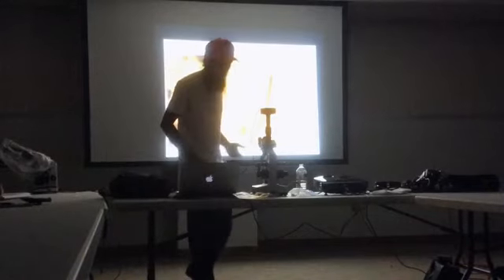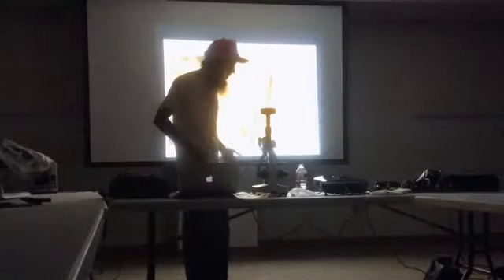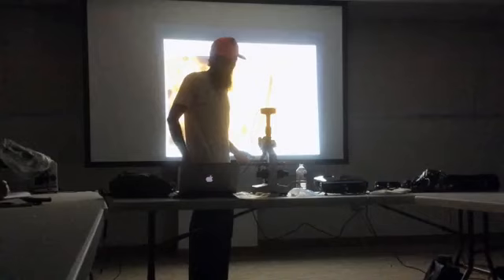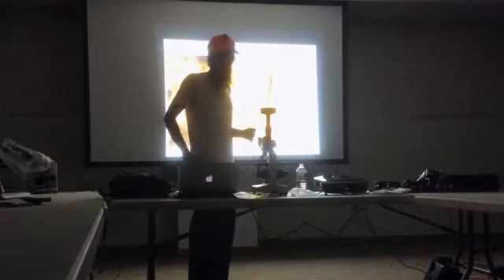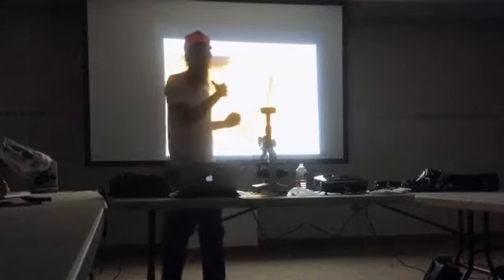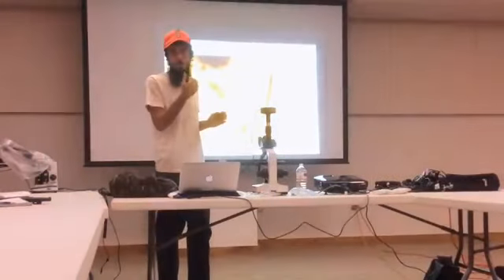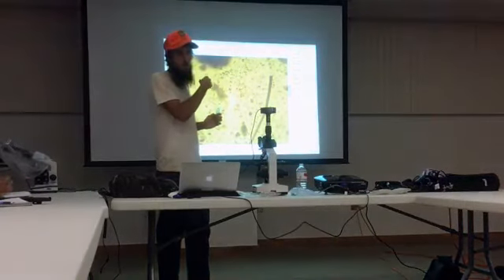Cool, so that was that sample. I've got to clean up some equipment till I do the next sample. But how do you want to do it? Do you want to all continue to look at these samples and go through the IMO? Sure. I like seeing them up there when you explain it to us. Okay, so I'll put the IMO up here.